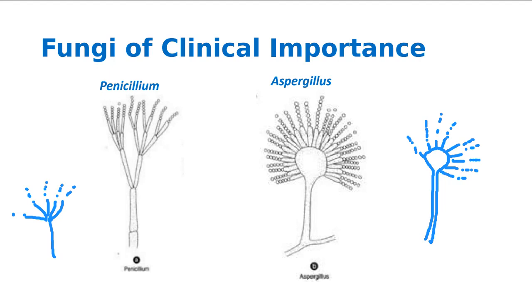Oh, well, let's not forget about that, Miss Sarah. So I'll draw a quick foot cell here. Yeah, I try to not draw as much as possible because I'm just not very good at it. Okay, foot cell. It's supposed to look like a foot. It's supposed to look like this.